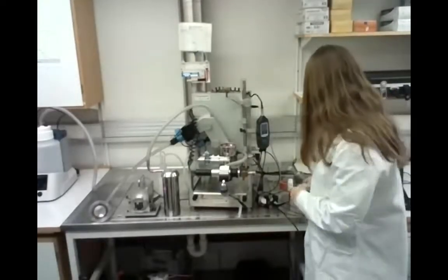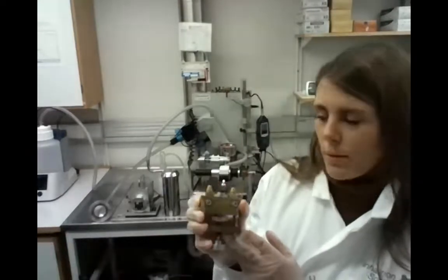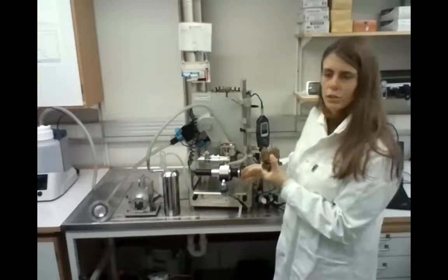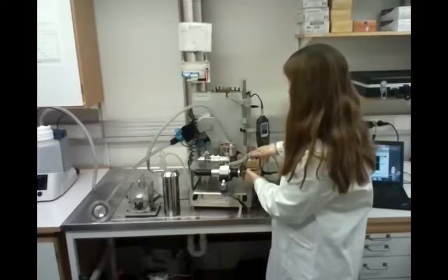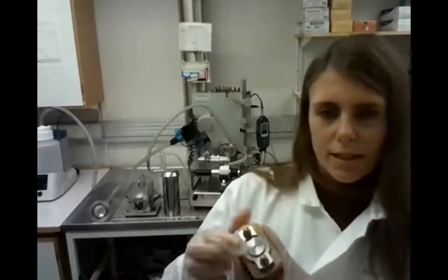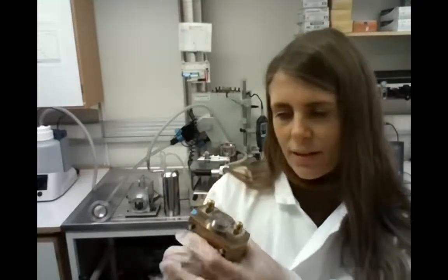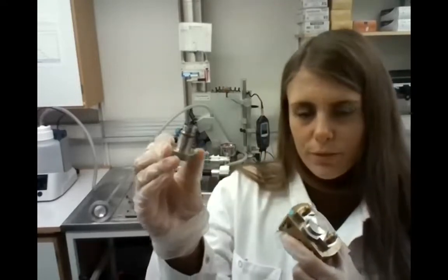And then, as an option, as Micke spoke about, another option is to use powder exposures. And this is the powder chamber mantle that can be exchanged with this inhaler inductor tube. So what you will do is to put this chamber onto this high pressure tube. And here you can see that you have a nozzle, and this is the nozzle where the powder will be shot out from. And in this, there's also the powder chamber where you will load your powder.